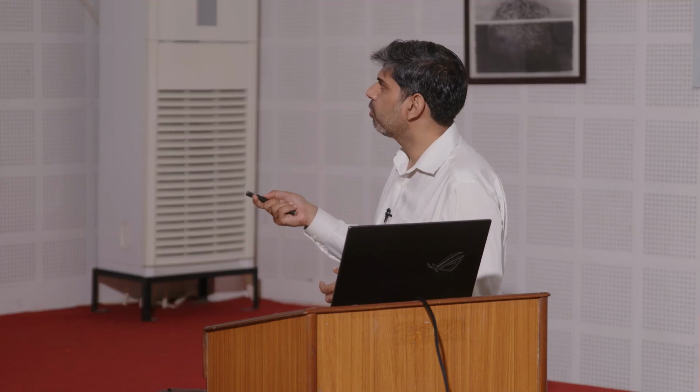So, now what we can do is try to use other ways of optimizing the electrophoresis process. We know that the initial plug width is also an important factor to improve the resolution. In this experiment, you see that the initial plug is a bit wide and also a bit distorted. There is a lot of work that has gone into how to optimize this injection step, so that you can have a very uniform initial plug width.